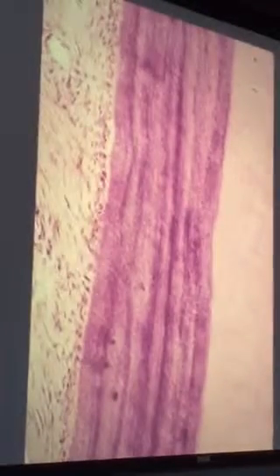How about these cells right here? They're not very active. This one's in the process of becoming another cell. It's a cementoblast. Okay, this slide's not going to be on the lab practical. This one could be. What is this right here?